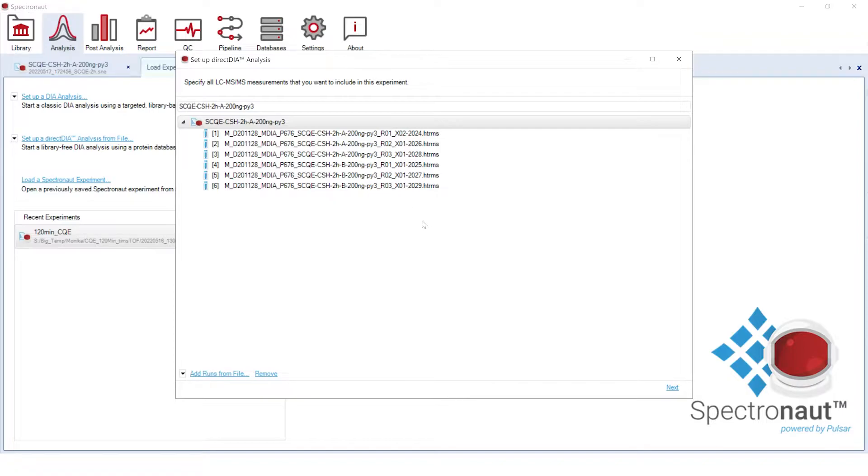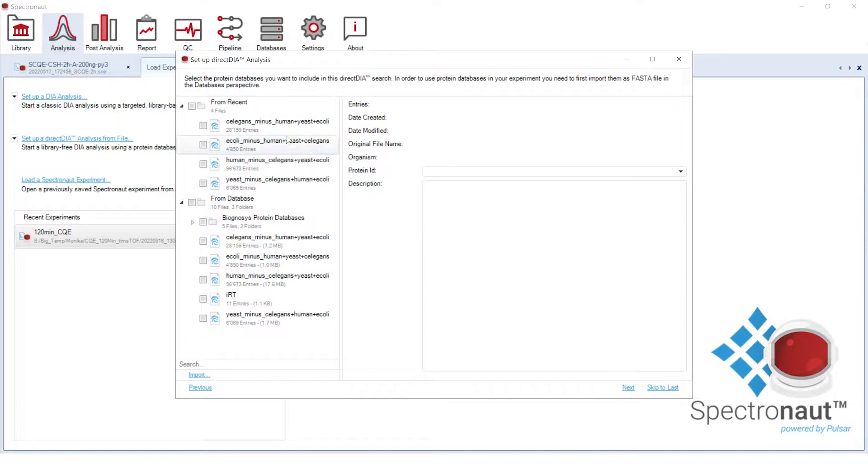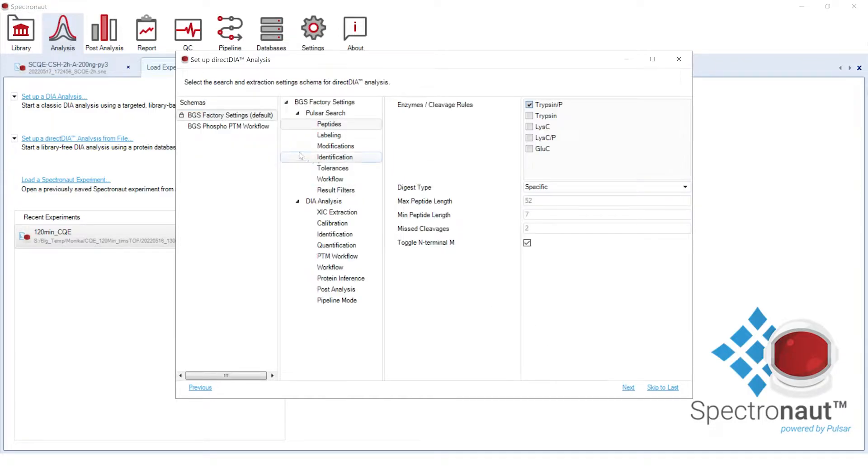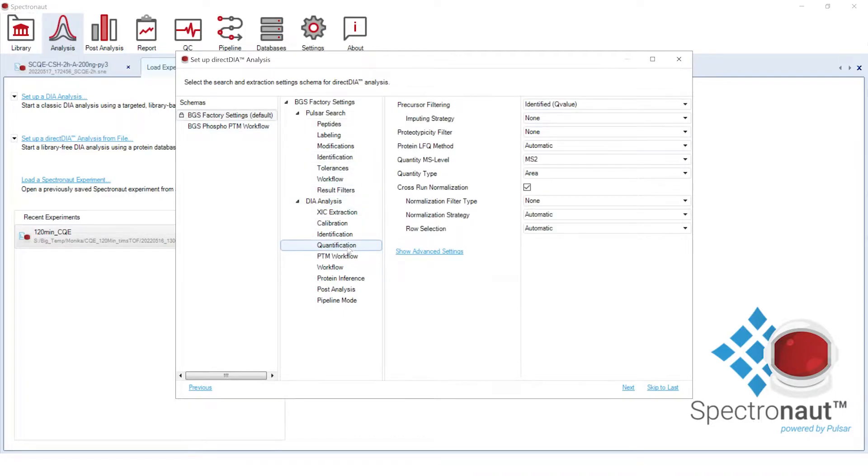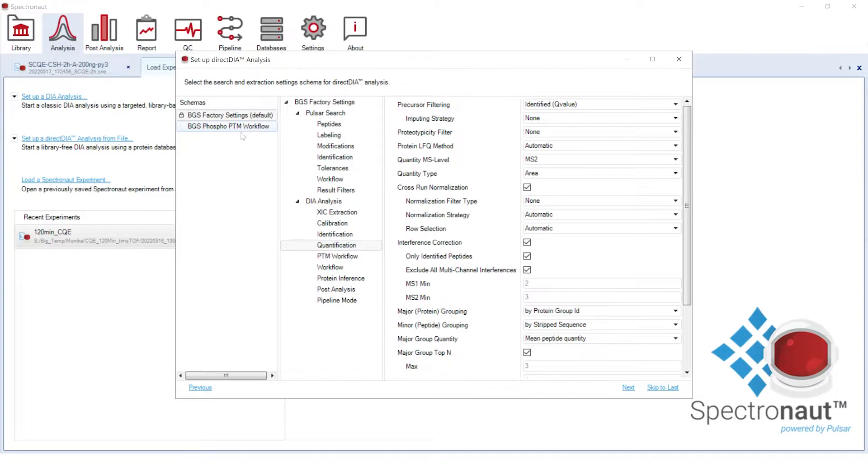In the second step, all we need to select are the FASTA files of the four species. In this analysis, we will use default settings as they are recommended for most DIA projects. You can view and change the settings if needed. For a better user experience, we introduced two different layouts in Spectronaut 16, including a basic set of settings and advanced ones. You could also select here a settings schema of your choice, predefined in the settings perspective.